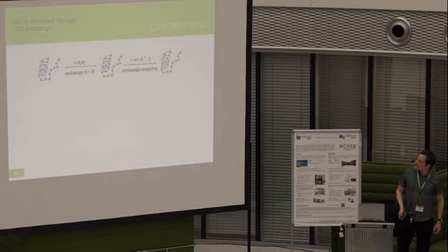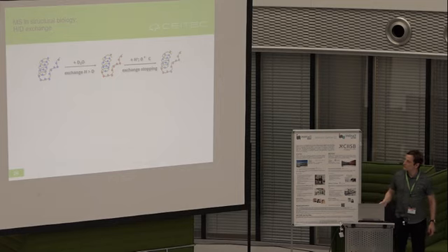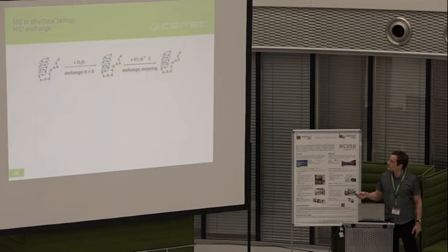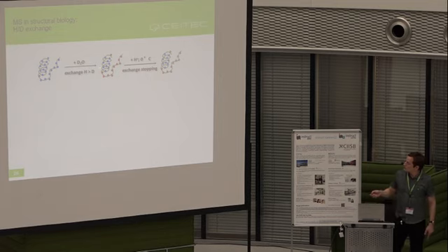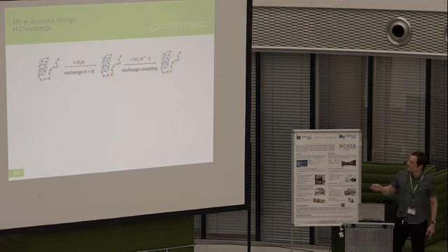The first one is called hydrogen deuterium exchange. Principally, it is something very simple. Just when your protein is exposed to the deuterated solvent, the hydrogens that are accessible to the outer part of the molecule, that are not fixed in some firm structure within the protein, are being exchanged. And of course, this exchange is changing the molecular weight of the protein and of the peptide parts, so that we can detect it by mass spectrometry.